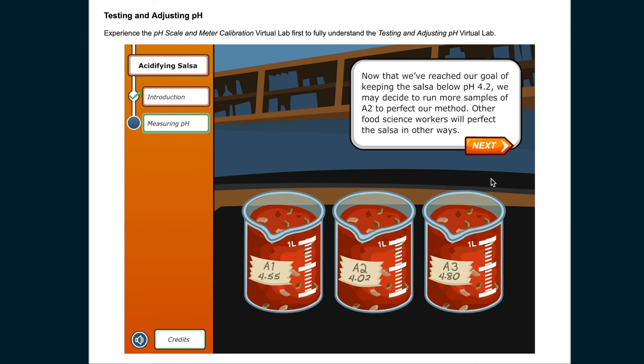Now that we've reached our goal of keeping the salsa below pH 4.2, we may decide to run more samples of A2 to perfect our method. Other food science workers will perfect the salsa in other ways.